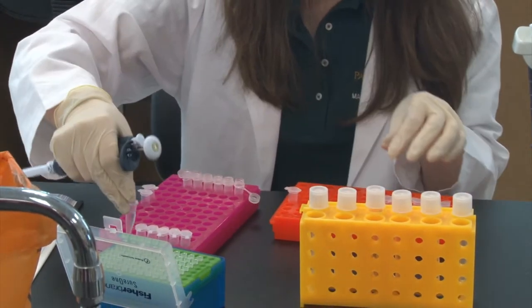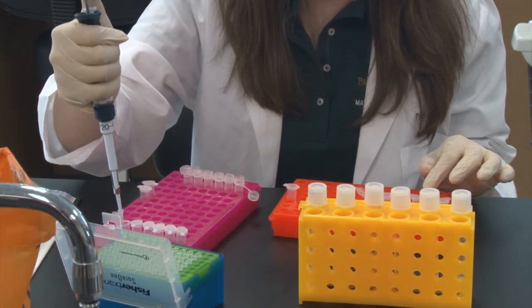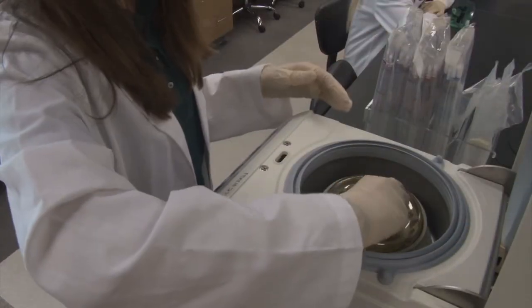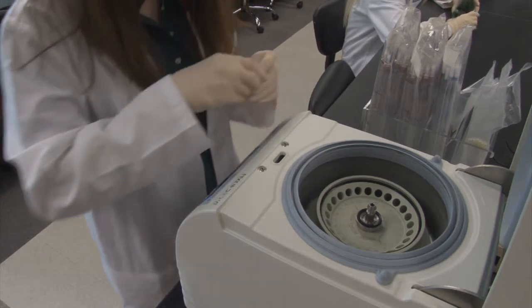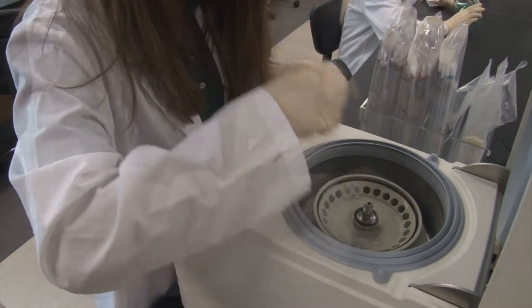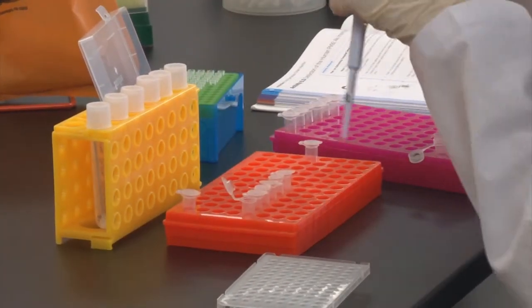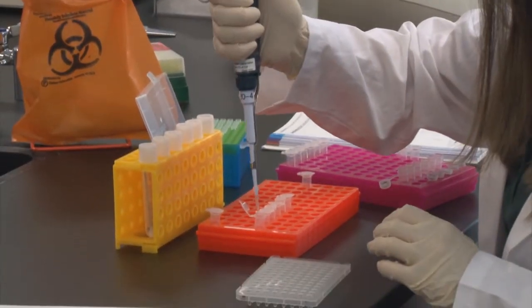Add 20 microliters of cells to the InstaGene matrix. After putting samples in the water bath at 100 degrees C for five minutes, centrifuge the samples at 2000 G for five minutes. Transfer 20 microliters of sample to PCR tubes.